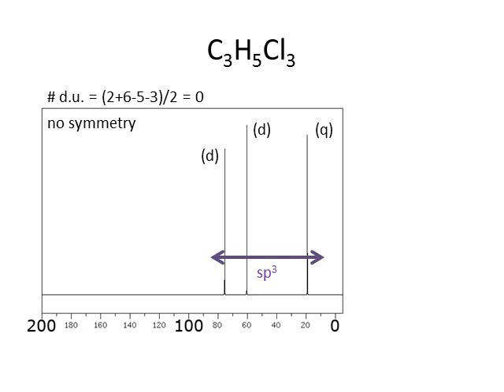Okay. But now I'm going to look at where those carbons come in along that x-axis and see what that tells me. Remember, signals roughly, I said about 0 to 70. This one over here is like at 77 or something like that. Those are rough borders. So these are all really within the sp3 region. It can't be in the sp2 region, which is 100 to 200. It can't be in the sp, which is right in here. Plus, I should say, we know that there's no double bonds. So these are sp3 hybridized carbons.